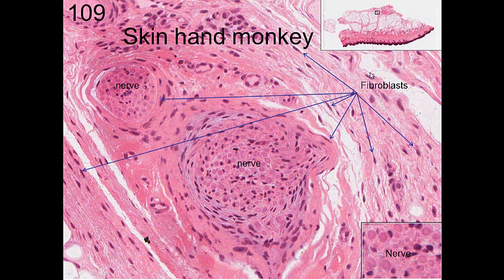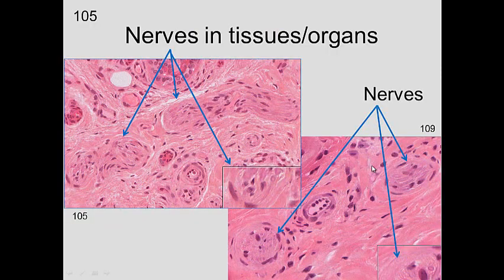Here's a monkey hand. You can see the skin and deep underneath the hypodermis, connective tissue, and here's a nerve. You can see Schwann cell nuclei, the perineurium on the outside, and the pink in the middle would be the axon. Nerve, nerve, nerve — and here we see fibroblasts. Fibroblasts make up the perineurium, and fibroblasts make up the capsule. Nerves in tissue organs are continuous; nerves are really kind of wavy. At higher mag you can see the myelinated axons and also the fibroblast perineurium.